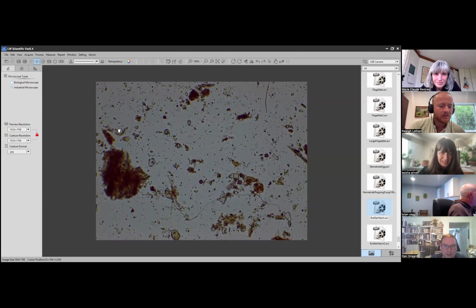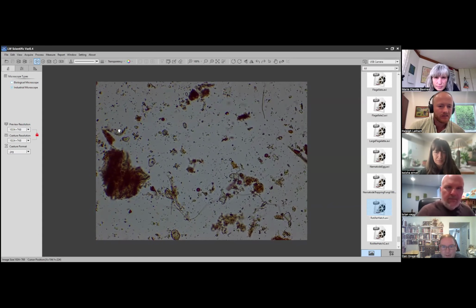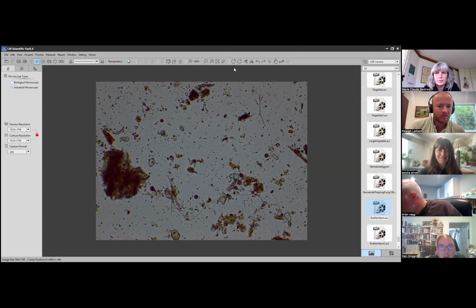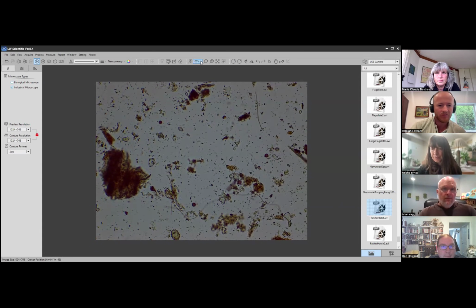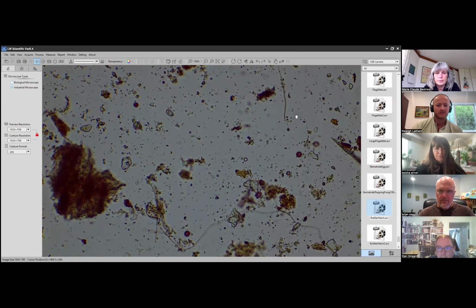This is a 1 to 10 dilution. Real quick, Dan, any chance we get this full screen? Let's see. If you do the window zoom in, or that little magnification, yeah, 150. Okay, sweet. That looks good.